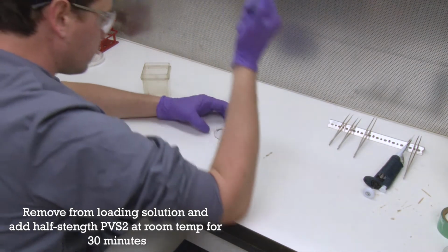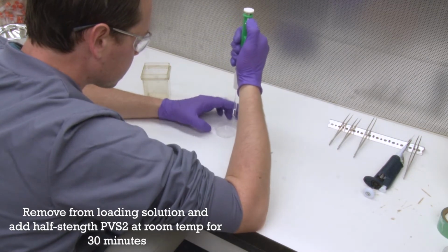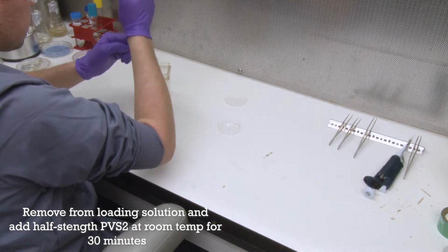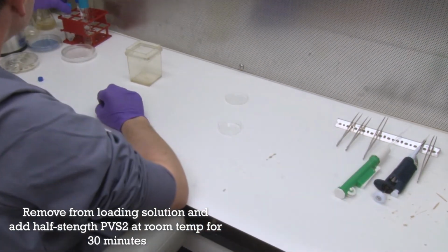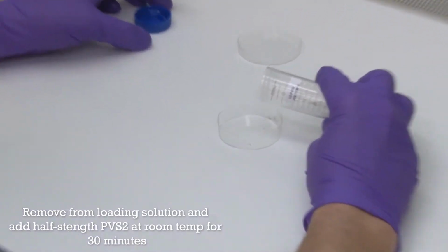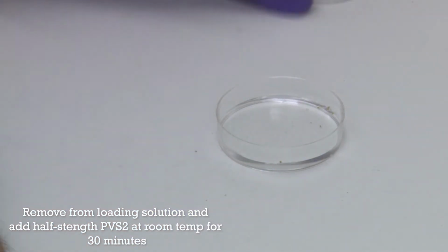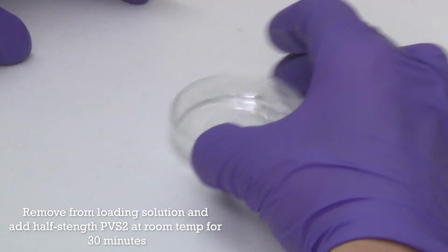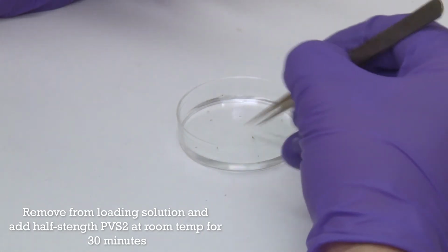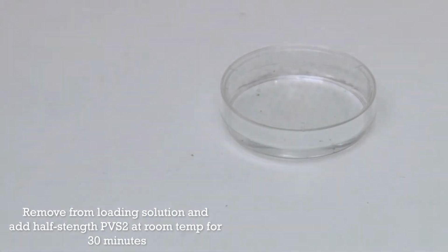And the loading solution is replaced with half-strength PVS2, and that will be kept at room temperature for 30 minutes. And again, give them a gentle stir occasionally to make sure all of the shoot tips are being treated evenly. If there's any shoot tips that stick to the side of the dish or beaker or whatever container that you're using, be sure to push them back into the solution.